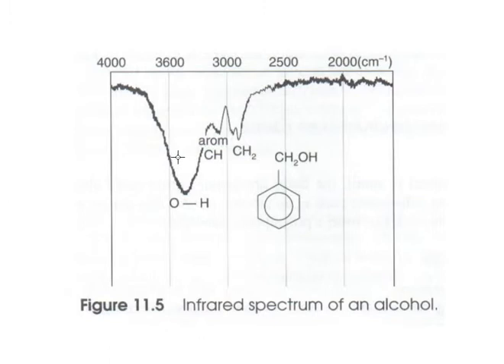Remember we mentioned that alcohol groups, the OH group, produce a peak that's relatively broad. The broadening is due to the existence of hydrogen bonding. There are various degrees of hydrogen bonding of the compound in its solution, and that produces some different absorption frequency, producing kind of a range, producing a broader peak. Now the benzene ring, the aromatic ring, has hydrogens, and they undergo stretching motion. Those stretching motions occur between 3000 and 3100, and there is the peak that they produce right there. The CH2 peak is the alkyl CHs undergoing stretching motion.